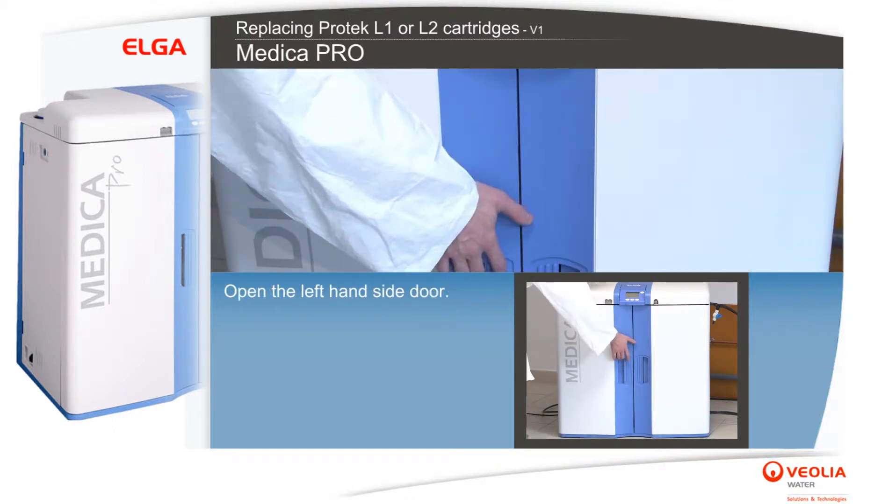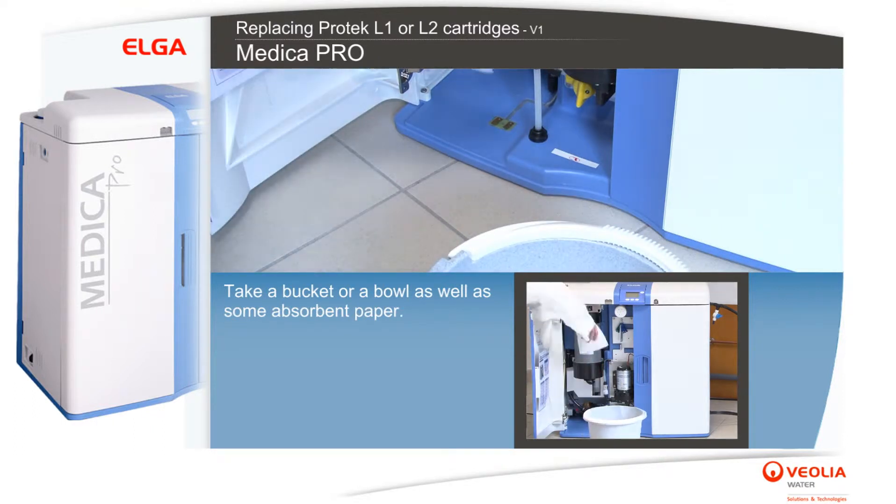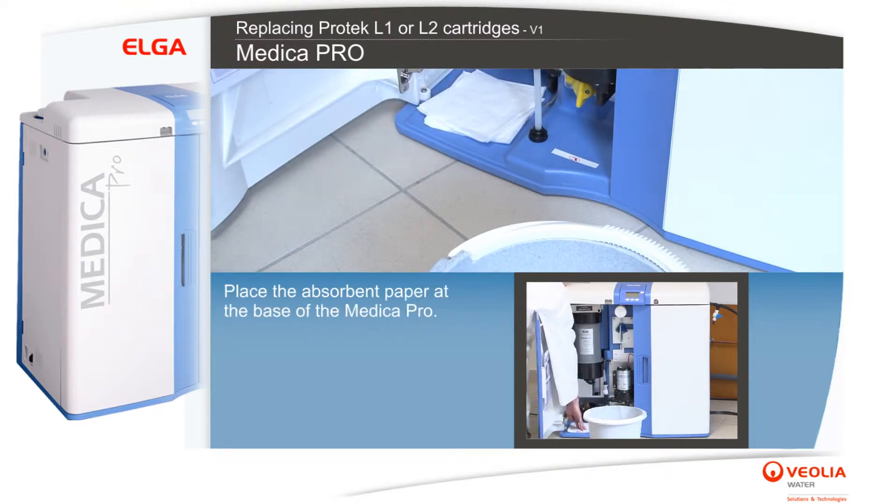Open the left-hand side door. Take a bucket or a bowl as well as some absorbent paper. Place the absorbent paper at the base of the Medica Pro.